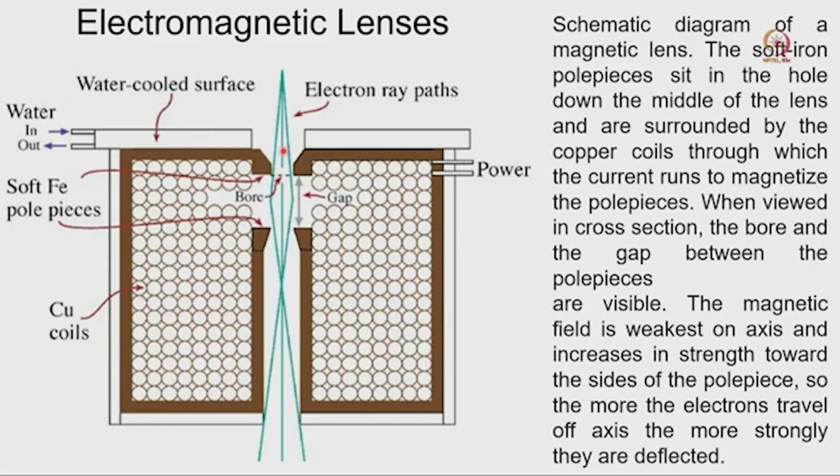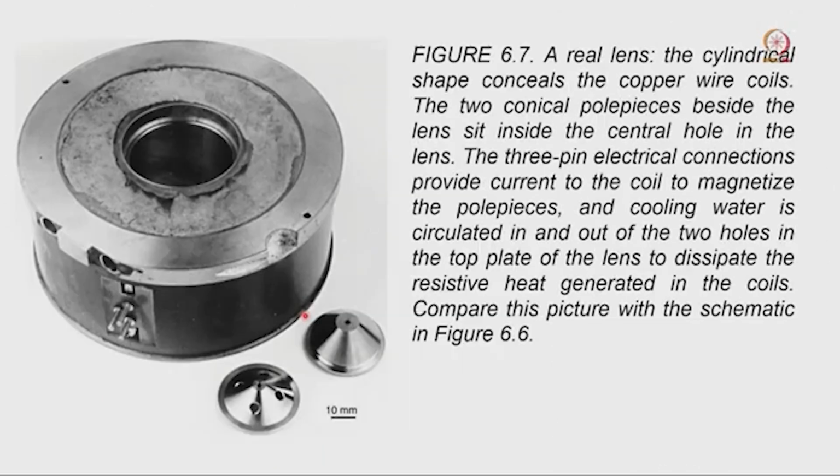So here you can see the stigmator as well as the deflector, deflecting the electron beam and changing the aberration of that beam. Definitely those also have some kind of magnetic or electromagnetic field which helps change the beam. That is the reason I said this is one of the simplest lenses. There are a lot of more complicated lenses, such as a quadrupole lens system, hexapole lens system, and octapole lens system. For different purposes we can use different kinds of lens systems.